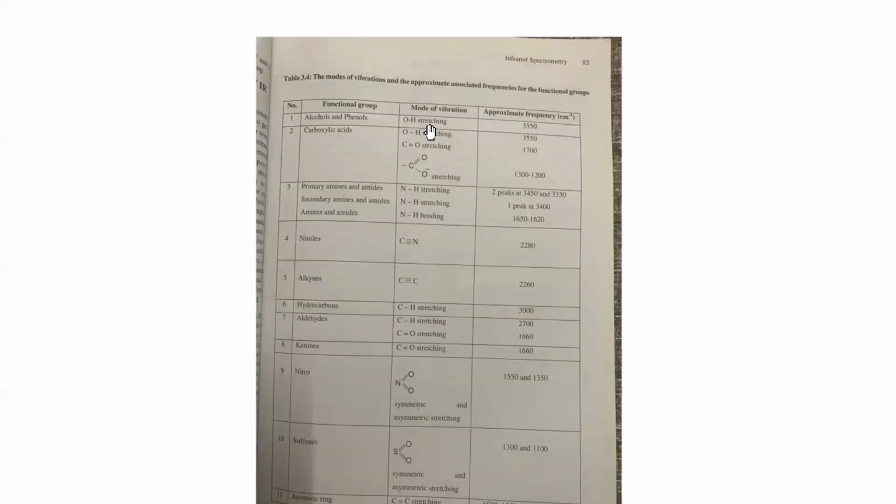These are the values for different stretching vibrations and bending vibrations. A few examples I'll give. OH stretching in alcohols is seen at around 3550. Carboxylic acid OH stretch, 3550. Amines NH stretch is seen at 3450. Nitriles and alkynes, C triple bond C and C triple bond N stretching, can be seen at wave number values of 2280, 2260.